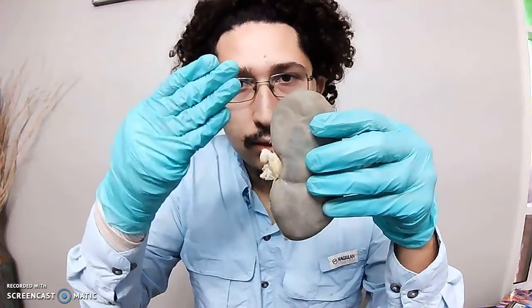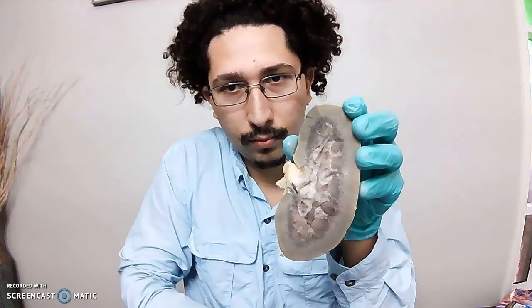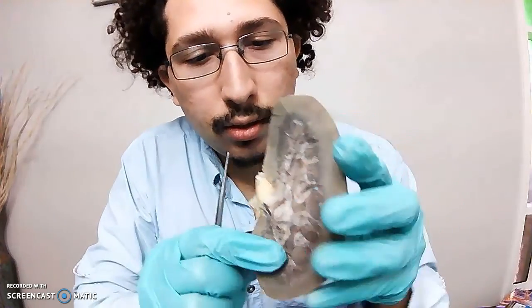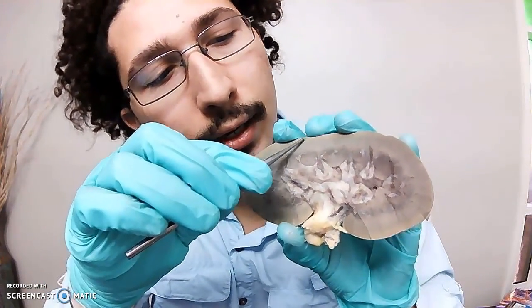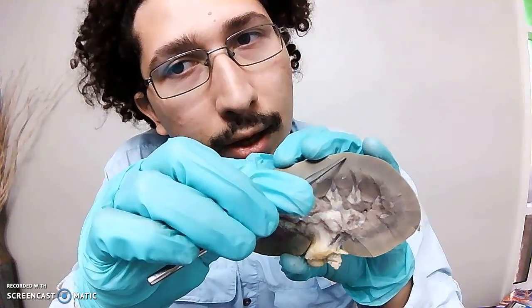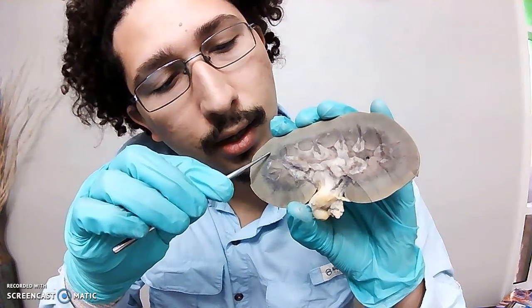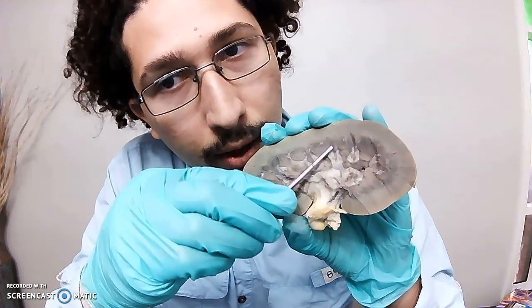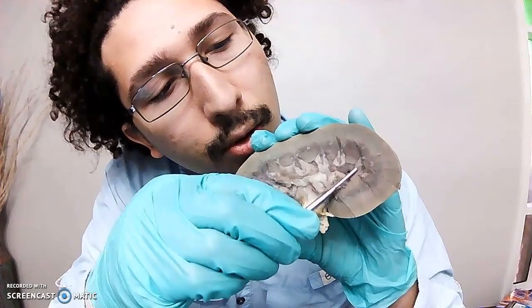Now, I cut the kidney longitudinally. Now we can see all the structures. So the outside layer of the kidney is called the renal cortex. Inferior to the renal cortex is the renal medulla. That's the renal medulla layer.